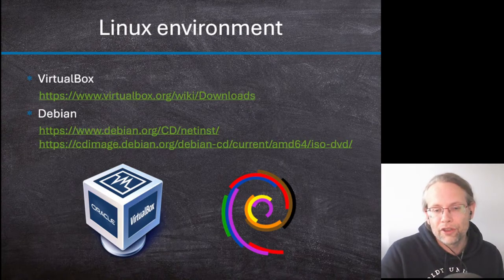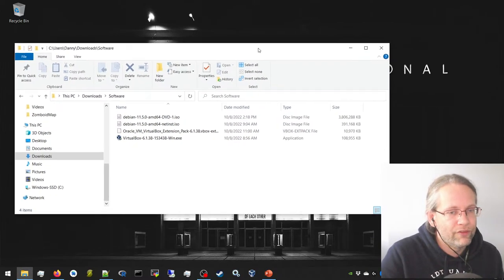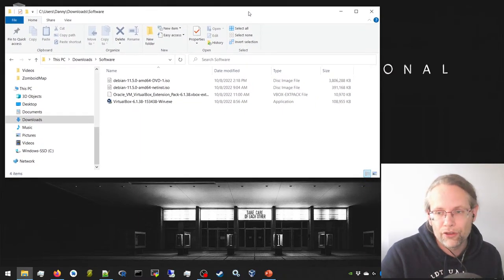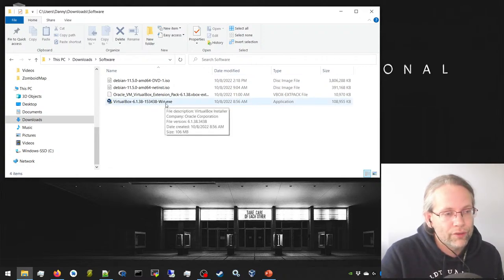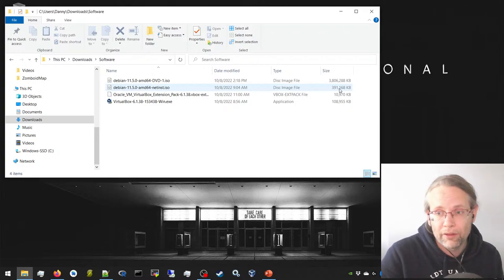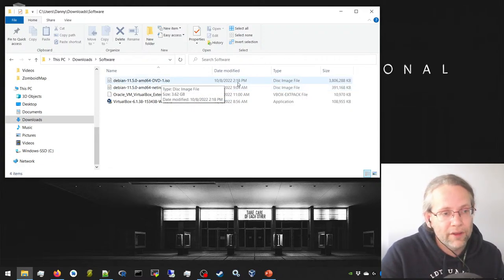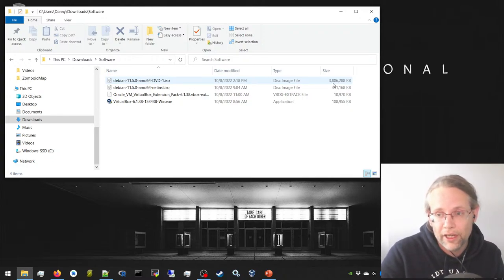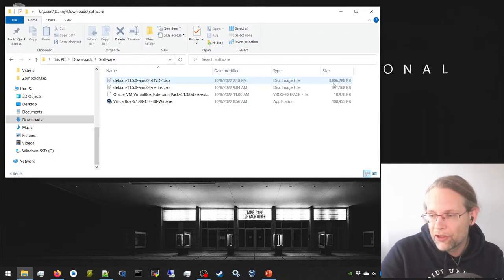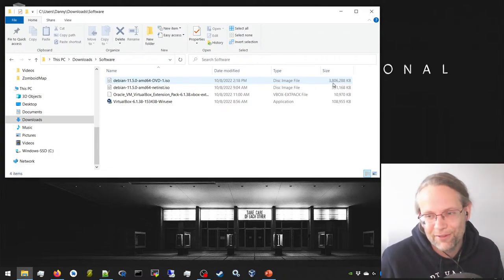Let me switch to my desktop so you can see it. I've already downloaded a few files to prevent long download times: VirtualBox, the VirtualBox extensions, and the Debian net install ISO, which is a small file that downloads everything. I'd advise anyone trying this at home to use the net install. For myself I downloaded the 3.8 GB image so the installation doesn't need the internet and goes a little faster.